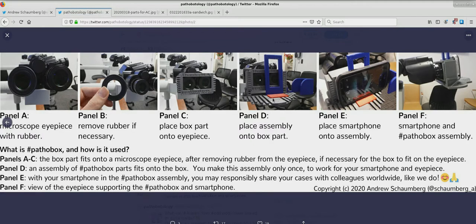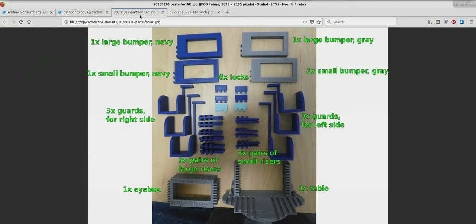Next, you'll assemble a system of parts that best accommodates your imaging device, such as a smartphone, to align with the light from your eyepiece. I'll give you a number of parts that allow you to universally put these imaging devices on your eyepiece.